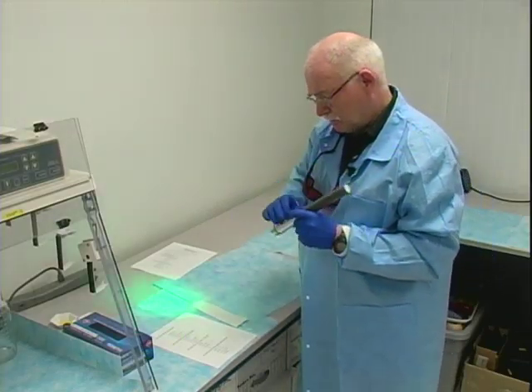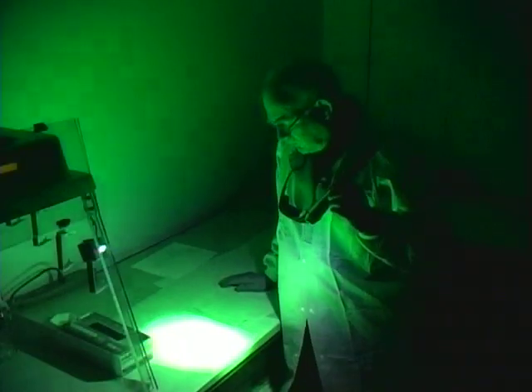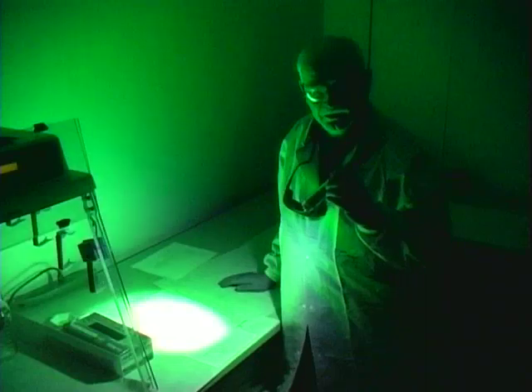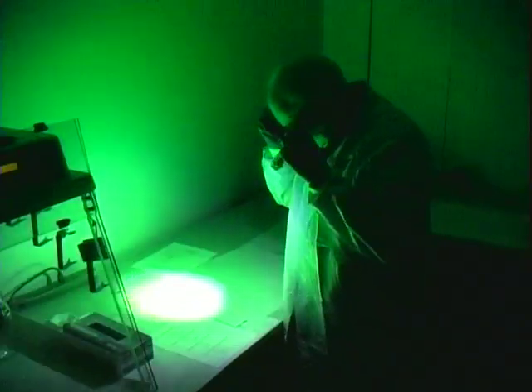We turn the forensic light on and turn the room lights off. Without goggles, all we see is green light. Putting the goggles on, we can immediately see a strong yellow fluorescence indicative of fingerprint development on our exhibits. With the thermal paper, which had previously been completely black with just a faint reddish-purple discoloration, we can now see clearly that there is strong fluorescent development in that area.